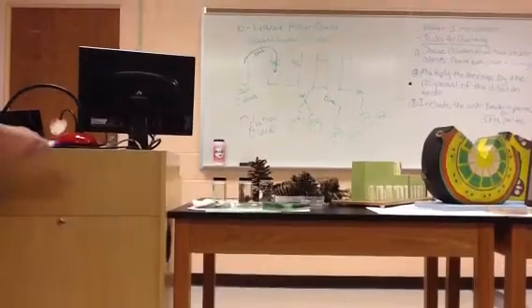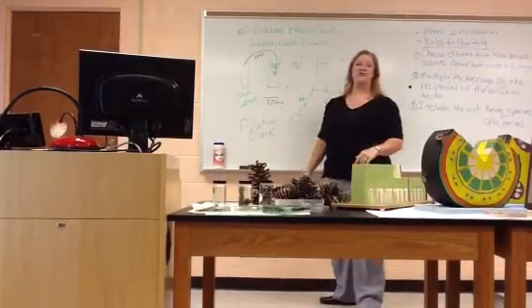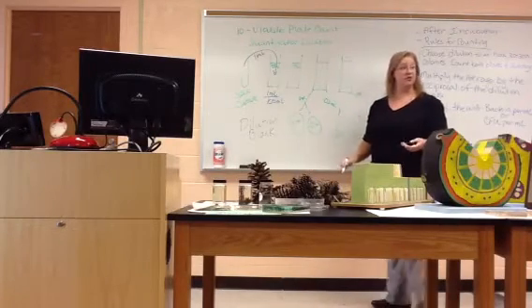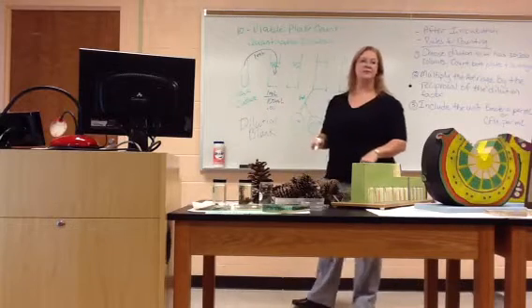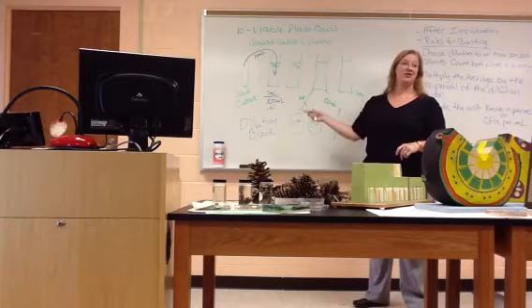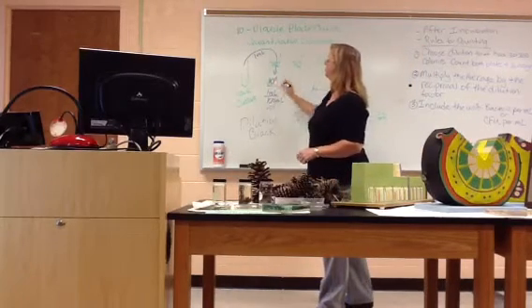So you're putting 1 ml of stock culture into 99 mils of water. What's your total volume now? 100 mils. 100 mils of total volume, and how many of those had bacteria in them? 1. So you've got 1 ml of bacteria in 100 mils of total volume. If you were to do that math, take 1, divide it by 100, you'd get 0.01, right? You can check me on a calculator later. And if you know scientific notation, you would write that number as 1 times 10 to the minus 2. So we're going to call this the 10 to the minus 2 dilution.